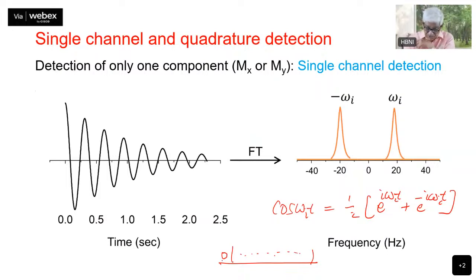So the offset has to be kept at one end, either at this end or at this end, it doesn't matter. When you keep it at this end, it will produce your real frequencies here, but the artifactual frequencies will be present on this side. We don't care about it; that can be filtered out. So when you put the carrier here, your maximum spectral region is this. The largest spectral frequency, omega max, is going to be from here to here. That will determine your digitization interval.